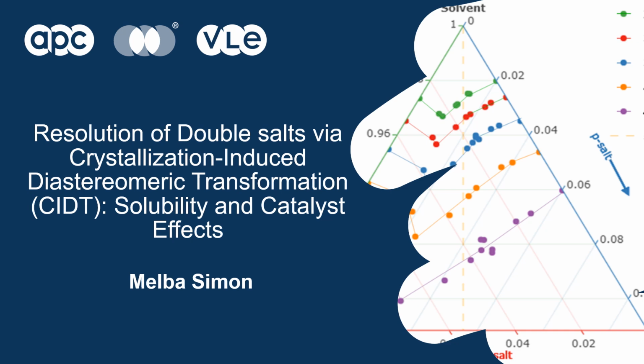Today I'll be discussing resolution of double salts via crystallization-induced diastereomeric transformation, solubility and catalyst effects. This talk will explore how CIDT can be leveraged as a powerful technique for resolving double salts, with a focus on the role of solubility and catalyst influences in optimizing selectivity.